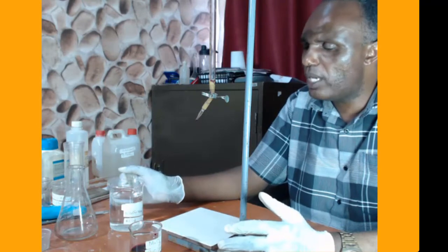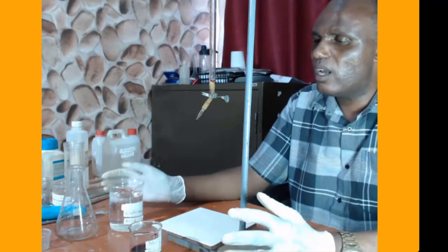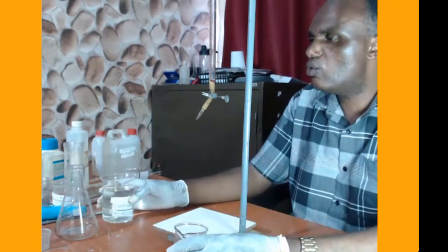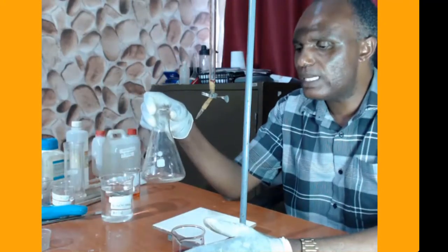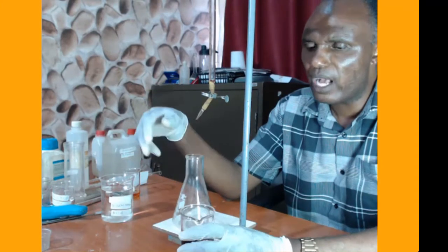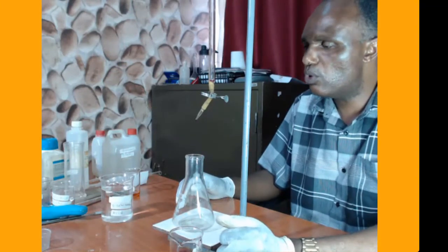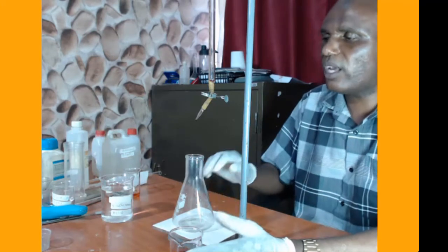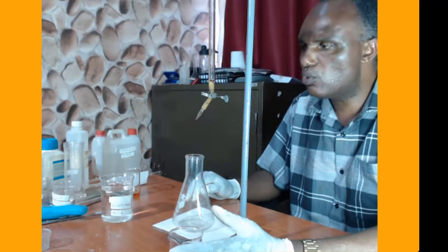that is not our main business. Our main business is to determine the mole ratio that happens between these two substances. So what we are going to do is put oxalic acid inside this conical flask, and then we react it with acidified potassium permanganate. Then we are going to do the calculations that involve the two substances. Then we determine the mole ratio between these two substances.